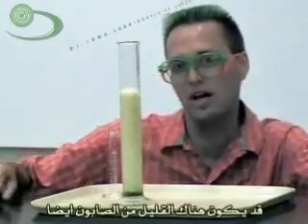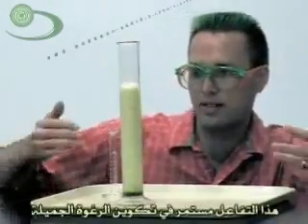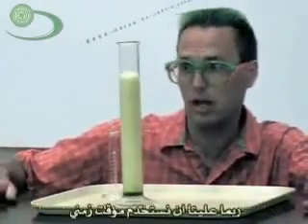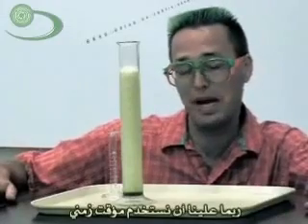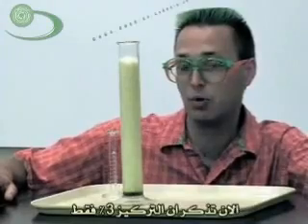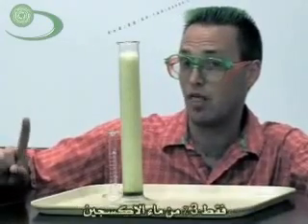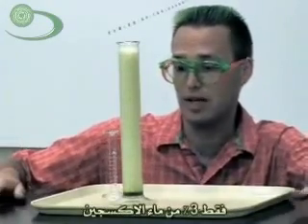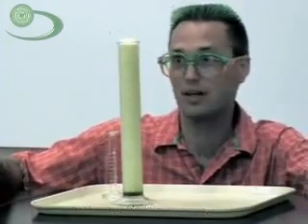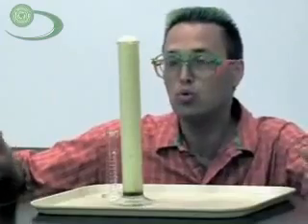And I put a little bit of dish soap in there, and that's going to make this cool little foam. And it's still going. So pretty cool. And we just may have to put this on stop time. And remember, this is 3% hydrogen peroxide. It's still foaming, and it's going to make a mess now. There it goes. Ooh.